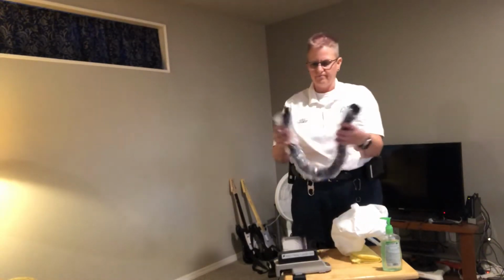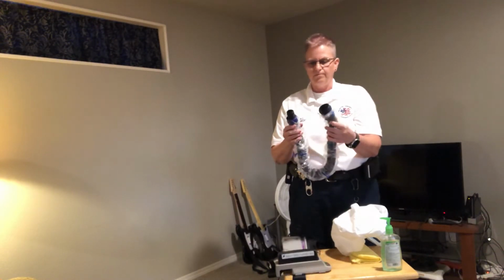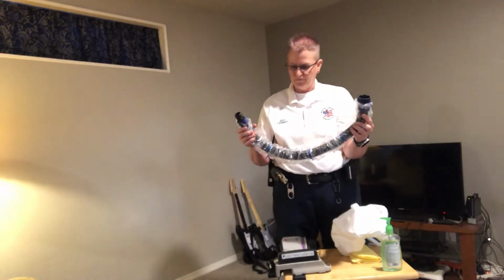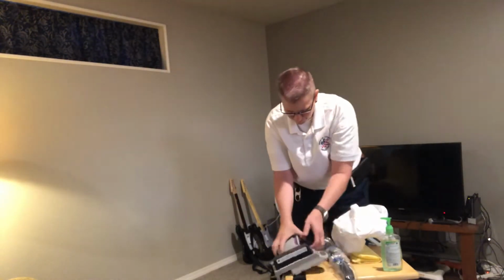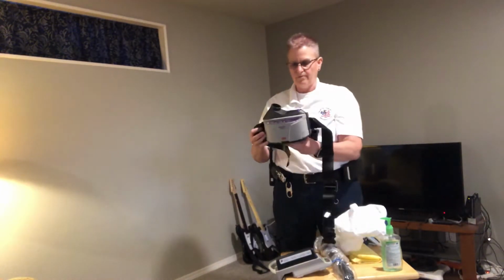Now when a PAPR first comes, it will not come covered. It's something you just have to put on top of the hose, and it has an important role in keeping the hose itself virus free and contagion free. Then you have the main unit itself, which has the motor, all that stuff, really what's going to be moving the continuous air and keeping you safe in your hood.